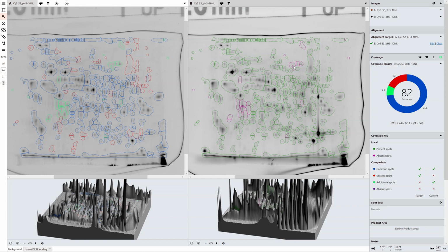So these are spots whereby there's been some kind of contamination, or my antibody has got some non-specific binding to something on my image. Whatever it is, the antibody is bound to something that is not registered with the total protein stain as a host cell protein. So these are spots that are there that shouldn't be there.